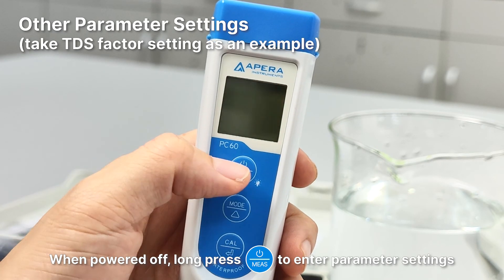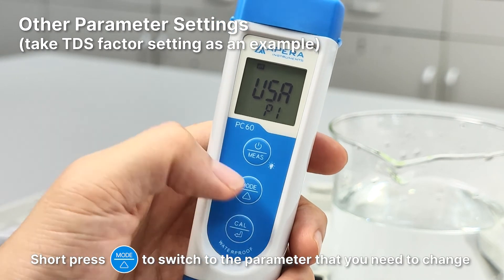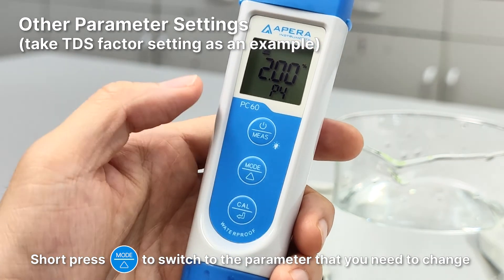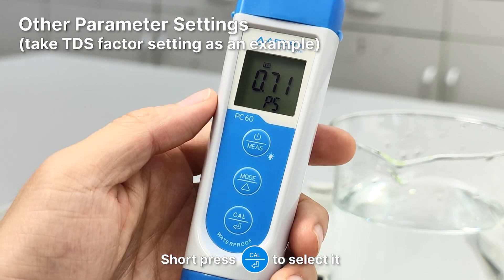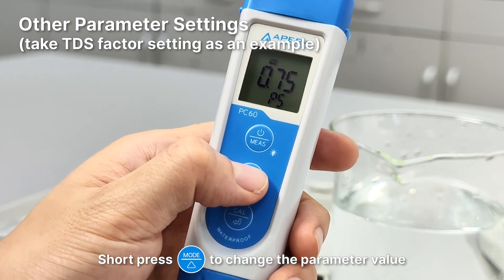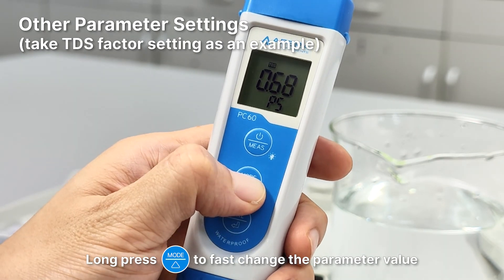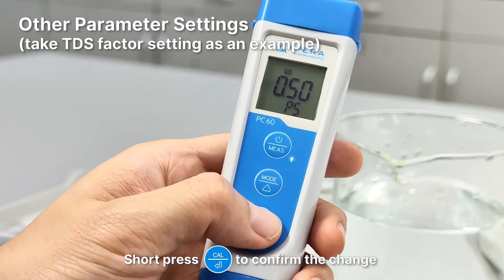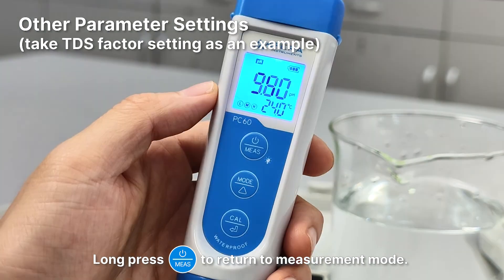Other parameter settings: When powered off, long press power to enter parameter settings. Short press mode to switch to the parameter you need to change. Short press Enter to select it, then short press mode to change the parameter value. Long press mode to quickly change the parameter value. Short press Enter to confirm the change, then long press power to return to measurement mode.